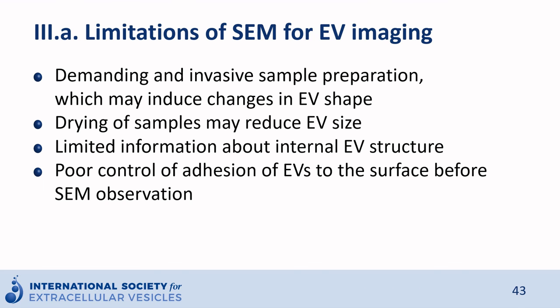The limitations of the method are mainly in the demanding preparation, which can damage or lose vesicles. Also, fragile internal structures cannot be revealed by classical scanning electron microscopy.